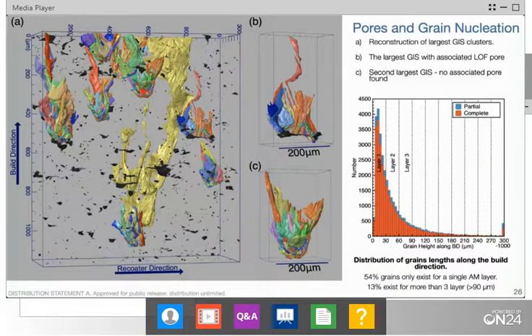And that would be similar to the formation of this cluster. This is the cluster I have reconstructed, this cluster here, and also this cluster here. Again, the perspective here is a little bit deceiving. It seems like it's associated with these pores, but those are actually closer to you in the reconstruction. This is a little bit deeper back. So that cluster is actually independent of these pores.